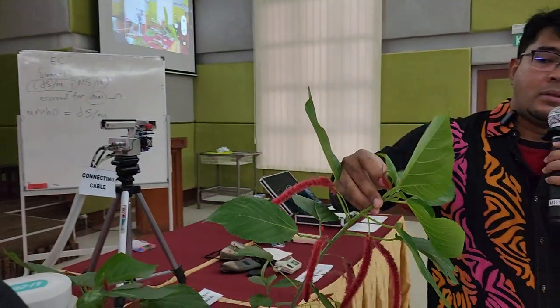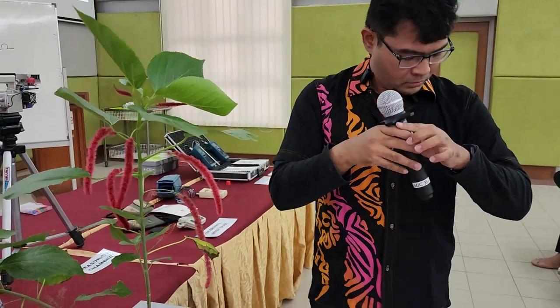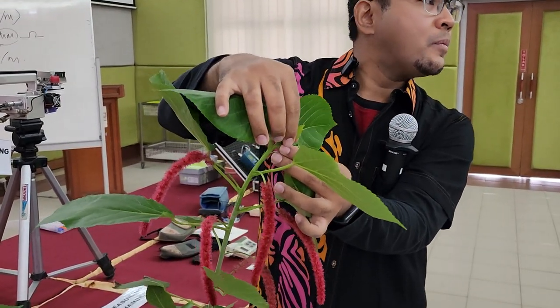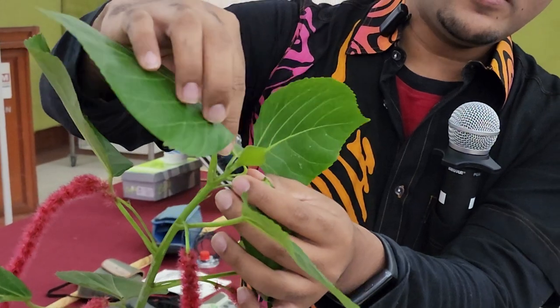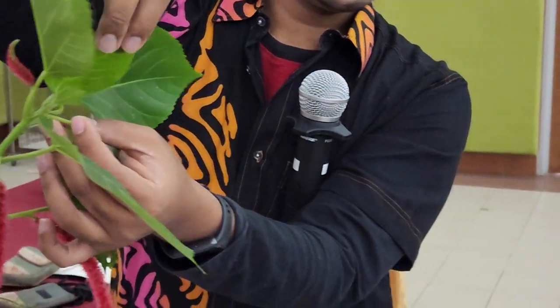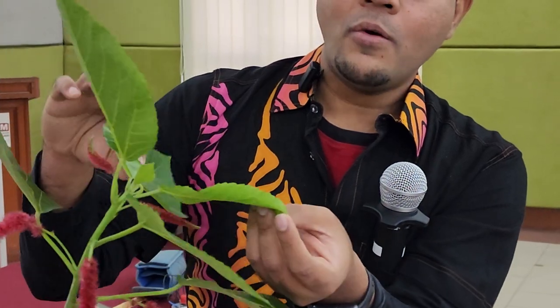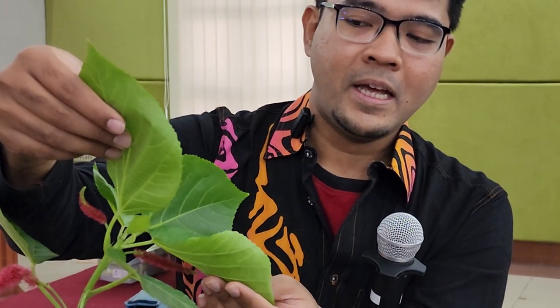Okay, this here, can I use this? Yes, this. This, can I use this? Why not? Don't say too small, it is expanding, still expanding. You are a science student, use the right word. So can I use this? Can I use this? Why not? Still expanding, okay. Can I use this? Okay. How about this one, slightly lower? So which one is safer?